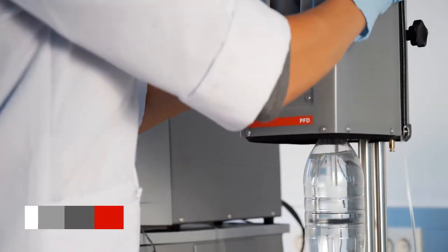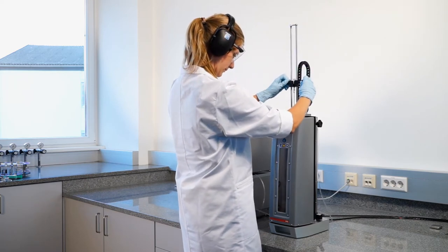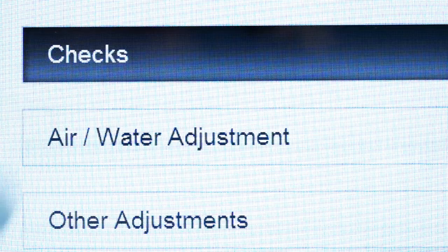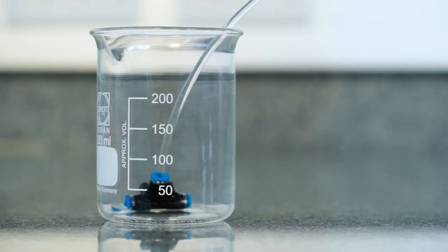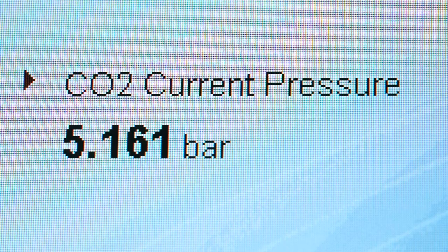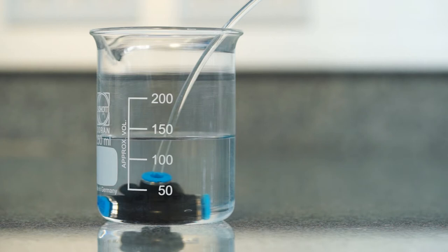To do so, use distilled and CO2-free water and activate the sample transfer. Select Water Check and follow the instructions on the screen. While the water check is in progress, you can easily check the CO2 current pressure and the sample volume. The pressure shown during filling has to be at least 5 bar and the sample volume should be at least between 140 and 160 milliliters for a PBASD SID system in its basic configuration. For each additional measuring module, about 20 milliliters extra need to be added.